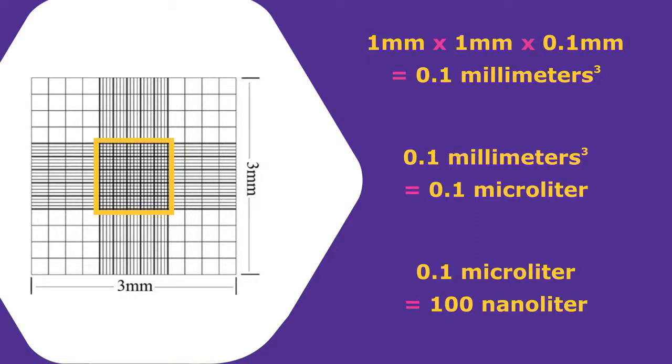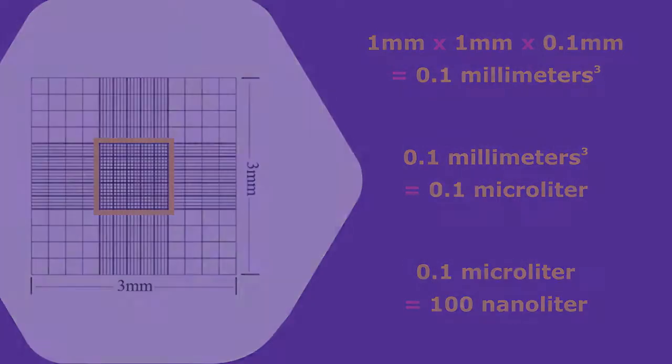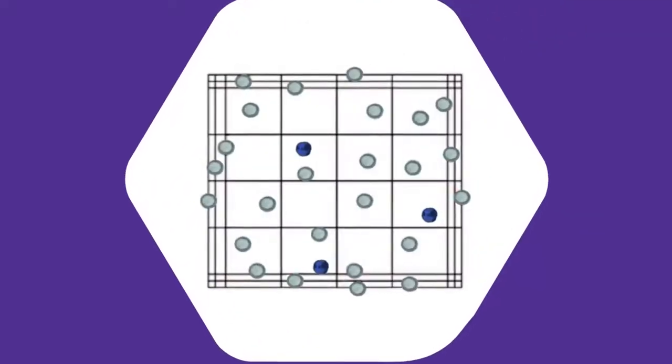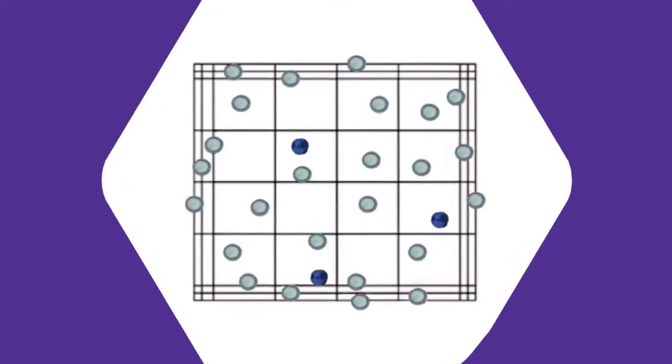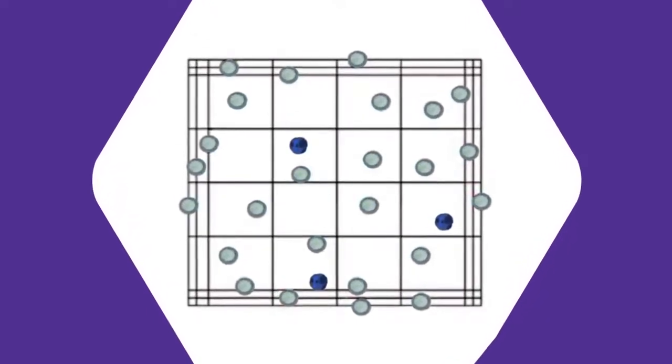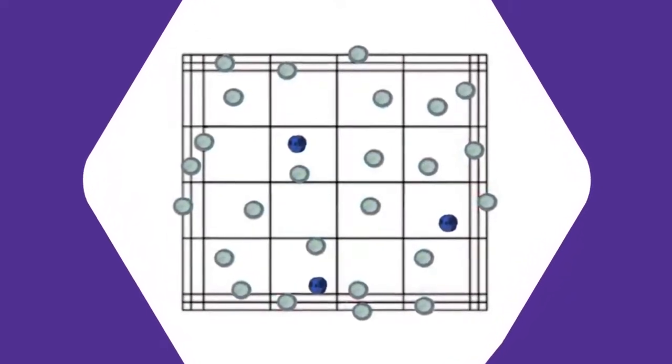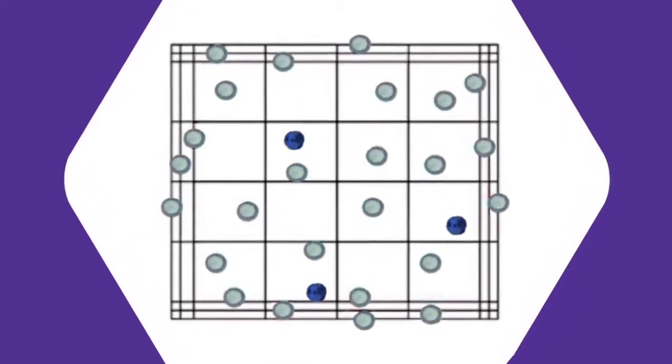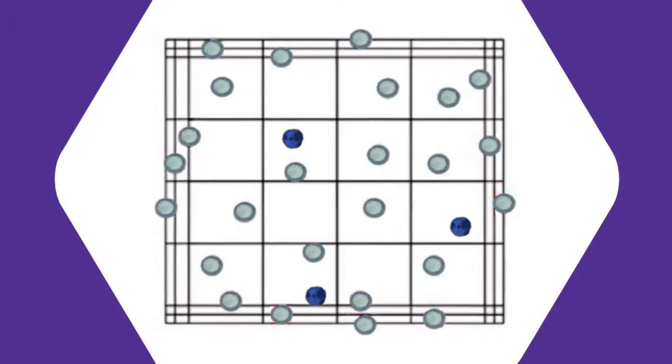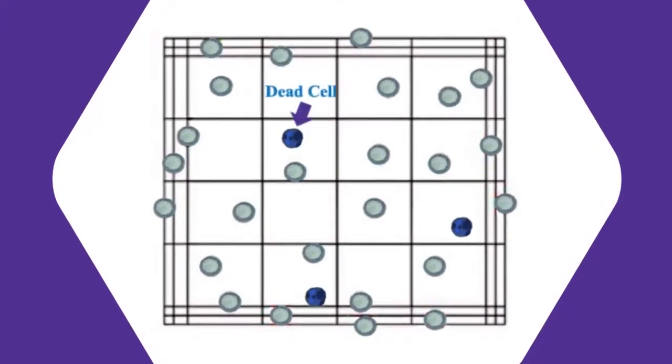Since we know the exact volume we're working with, it is just a matter of counting cells to obtain cell concentration. Let's take a closer look. In this example, we'll use the same center chamber for cell counting after loading cells that are mixed one-to-one with Trypan Blue. Since Trypan Blue will stain dead cells with dark blue color, we have a very convenient way of distinguishing dead versus live cells.